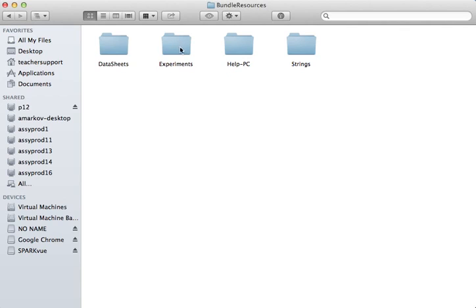Within this we can see the Experiments folder. This is where the original eight labs are that ship with the SparkView 2.1 application.